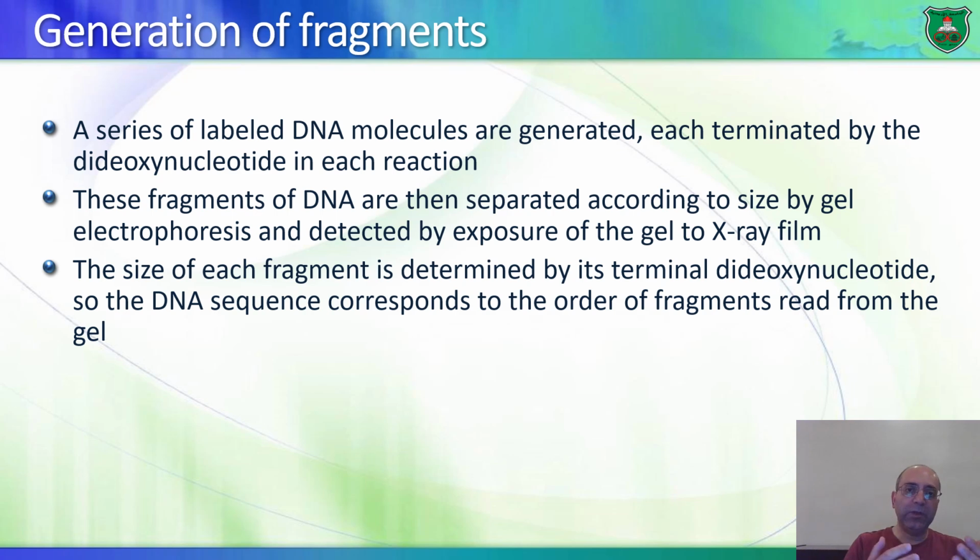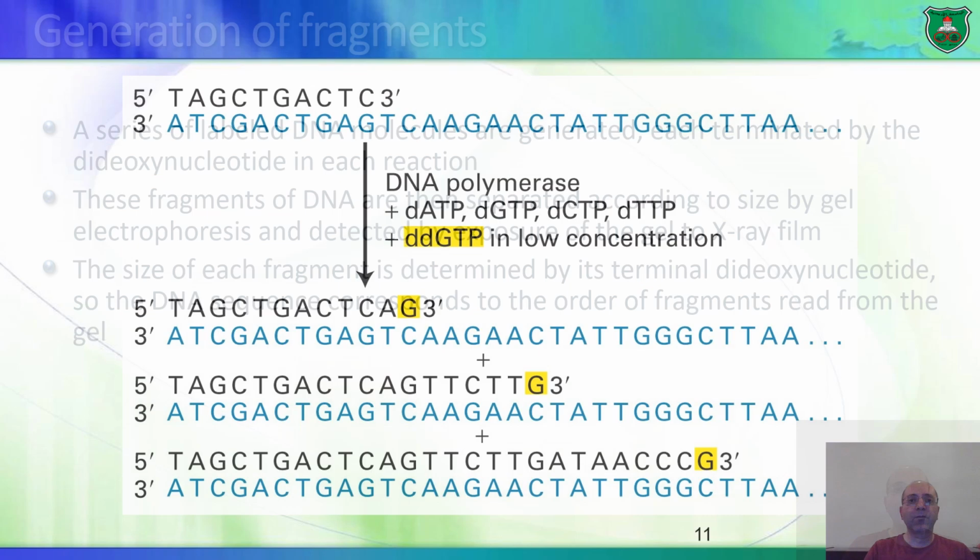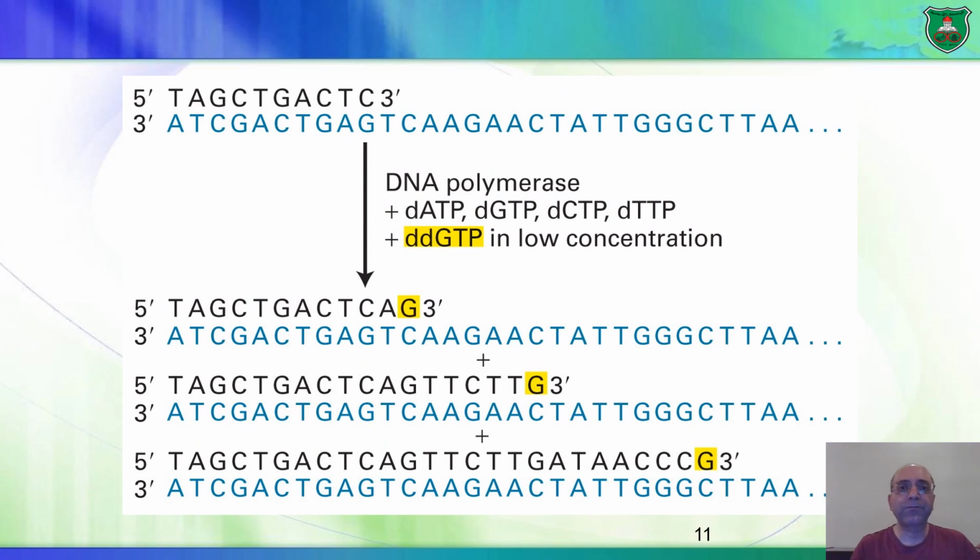And then we can expose the gel to X-ray film, and we can detect the signal. That's if we use radioactivity, but no one uses radioactivity anymore because it's risky, and there's a much easier method right now. I'll talk about it, but I just want to show you how it works. So here's the idea here.